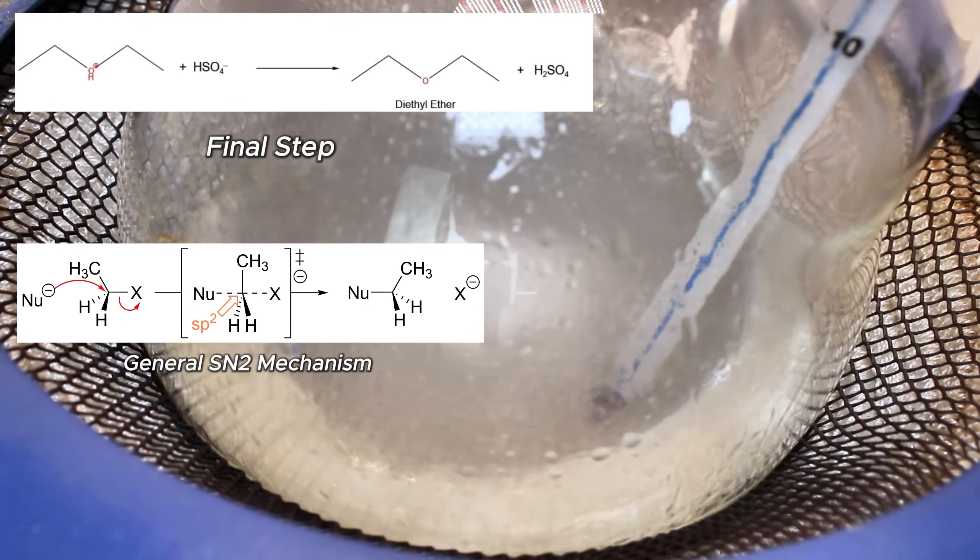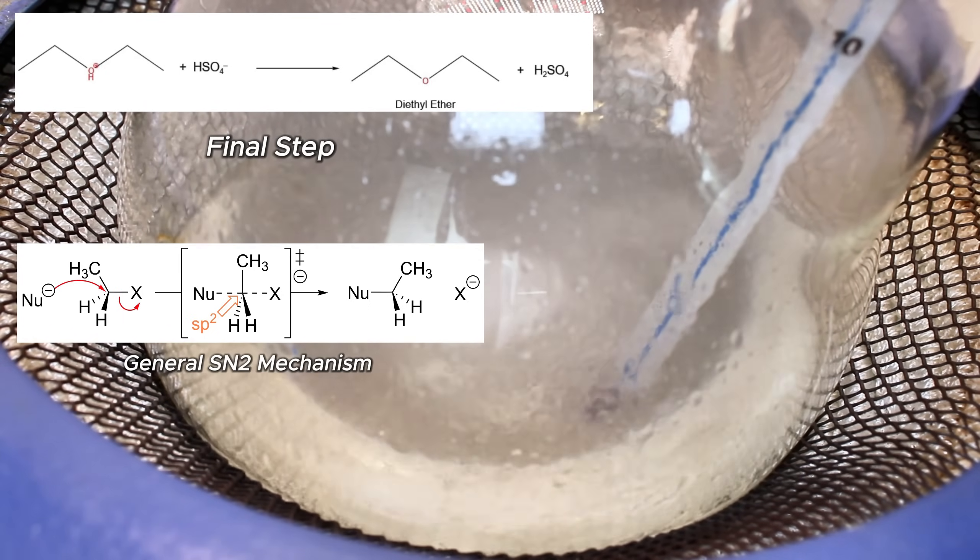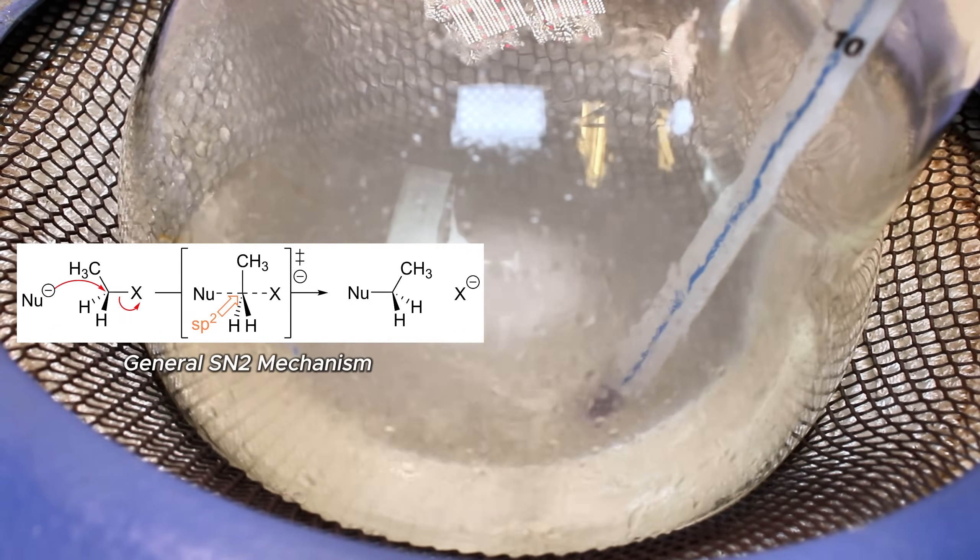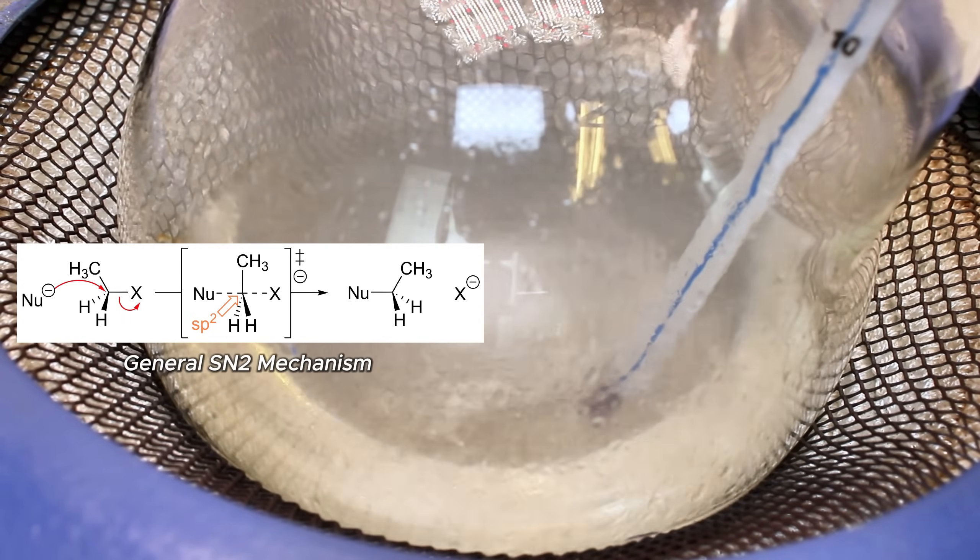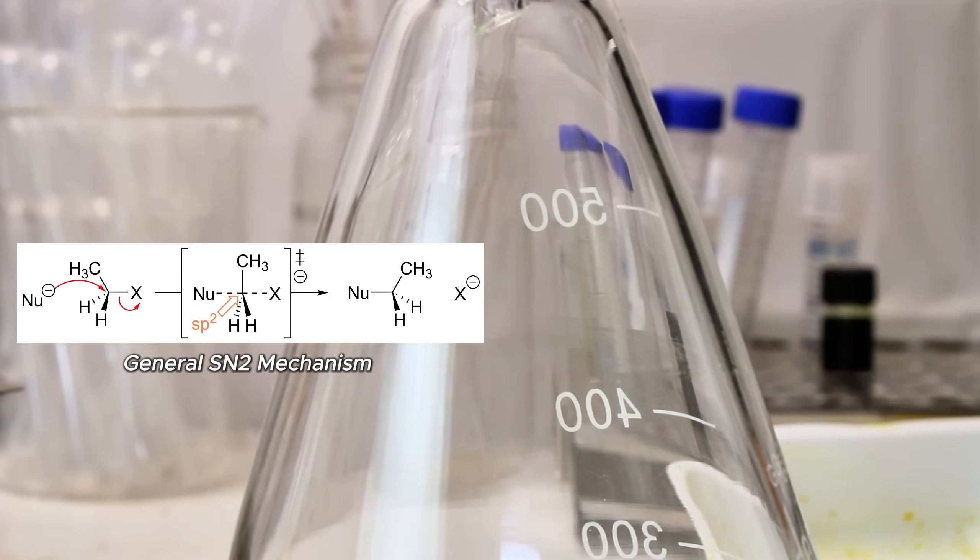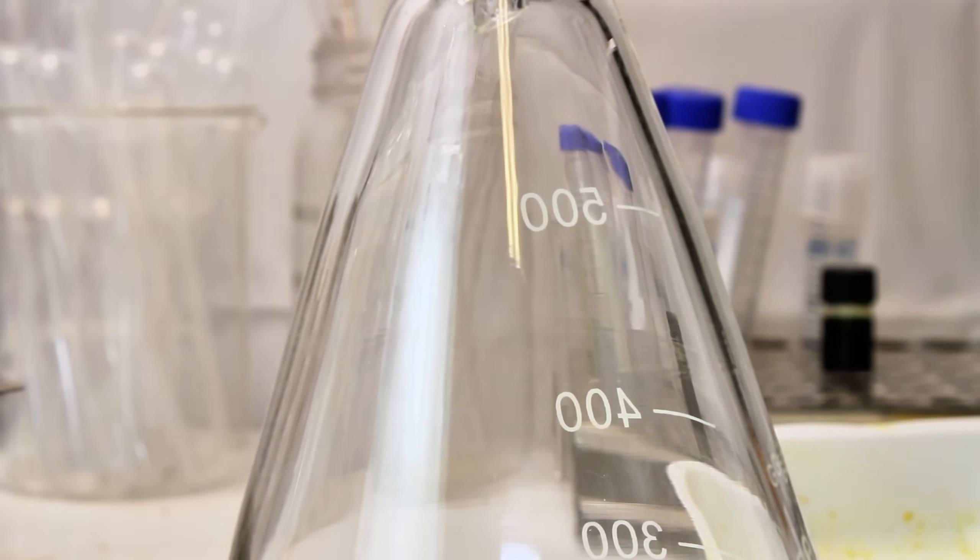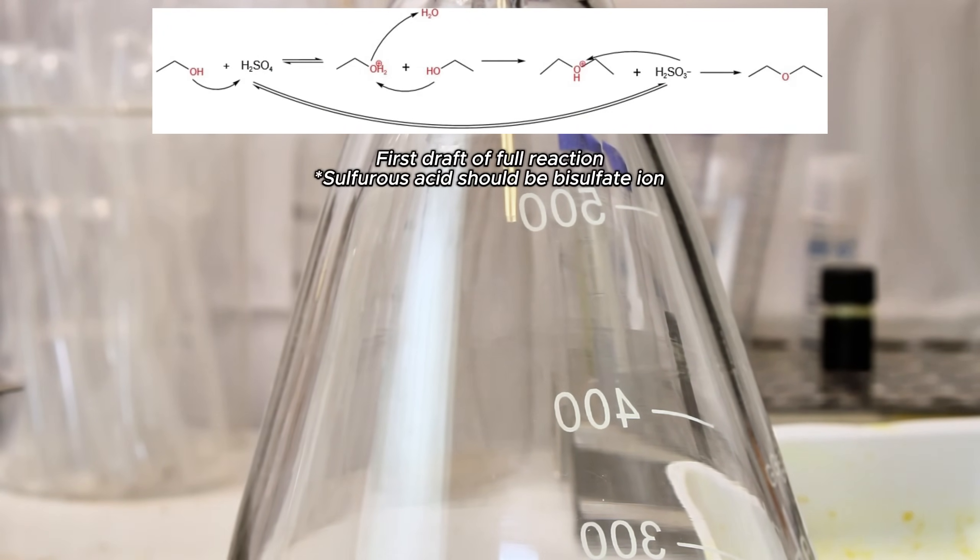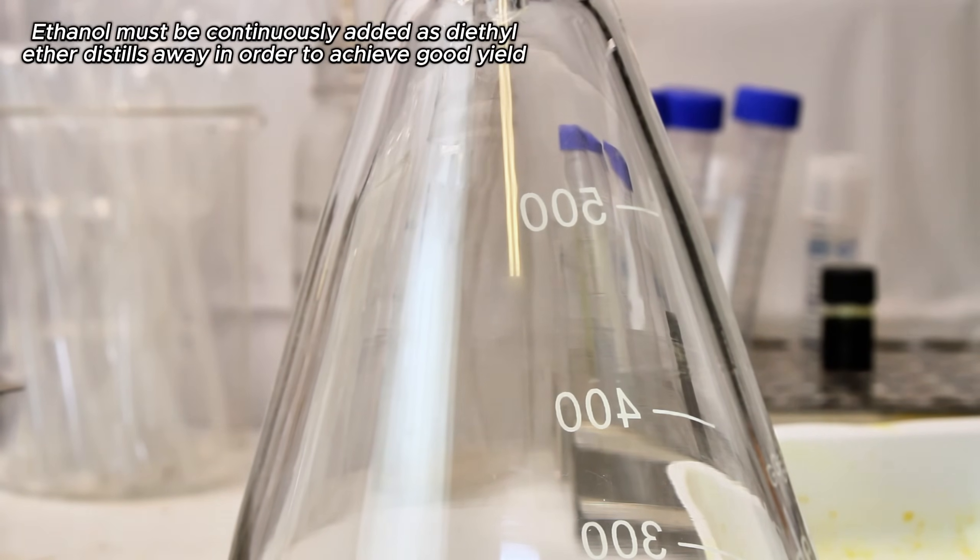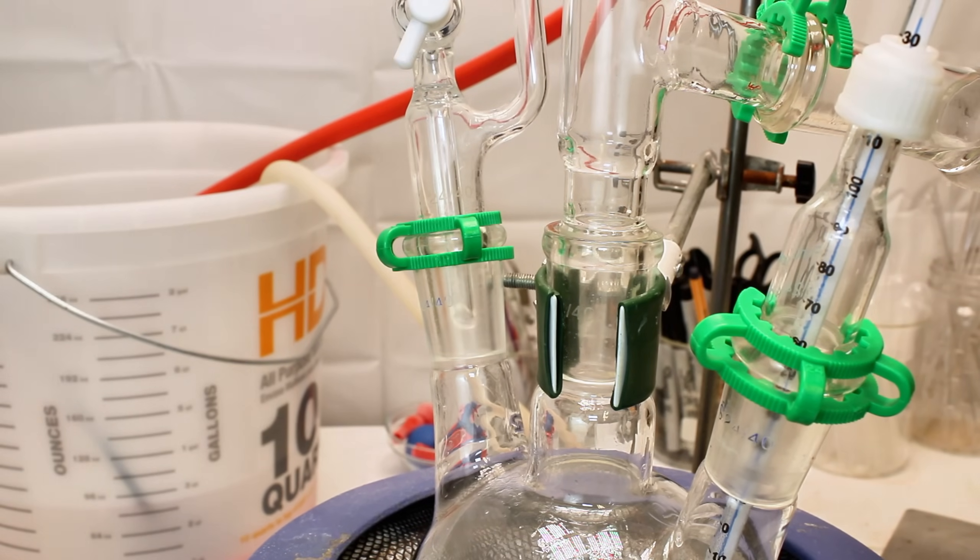Now because this is an SN2 reaction, both the neutral ethanol and the protonated ethanol are required for the reaction to proceed, as their displacement of water is the rate limiting step. Because of this, if all the ethanol was added at the beginning, you would produce some amount of ether and then be left with a flask containing nothing but sulfuric acid and protonated ethanol that's unable to further react. With that said, the purpose of the addition funnel is to continuously add more ethanol as diethyl ether is generated in order to maintain some degree of balance between the two in the reaction mixture.